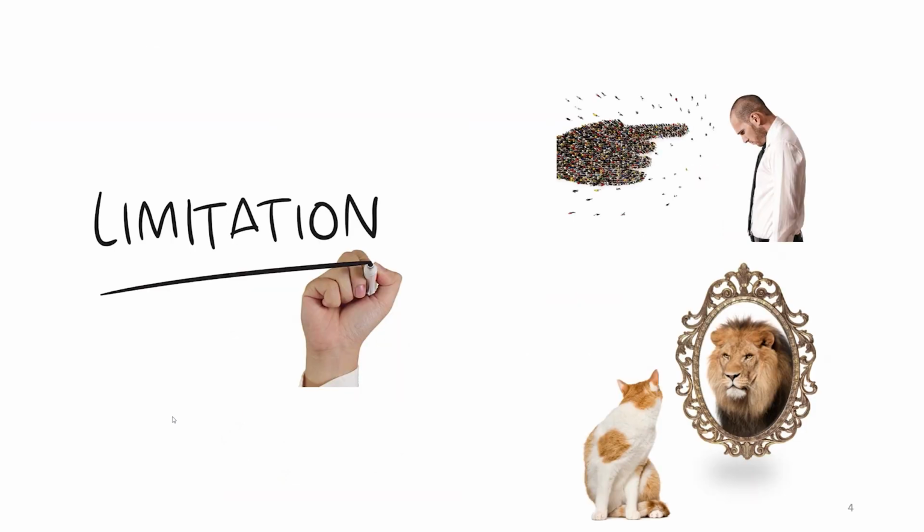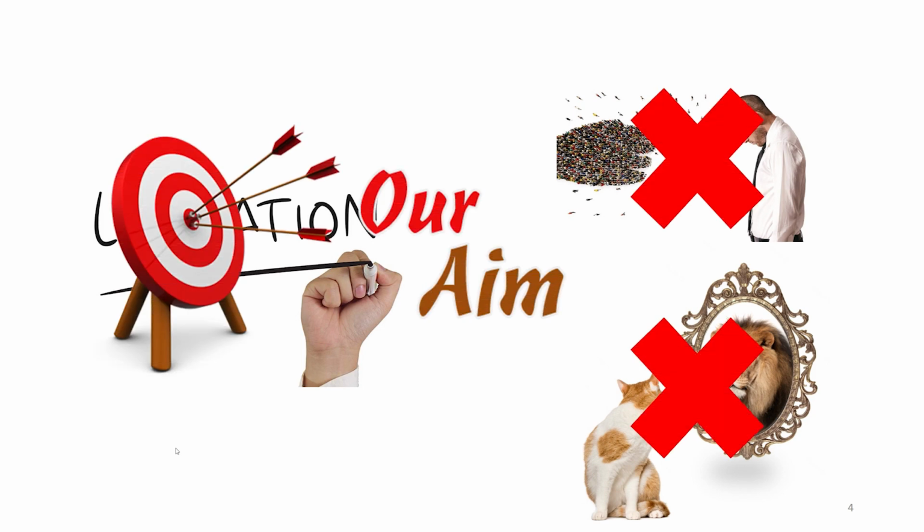First of all, it is prone to human error, because although the detection is done by machine, the calculation is still done by humans. The second reason is overestimation, because several parameters have been shown to be overestimated by this method. So the aim of our study is to eliminate the human error in the analyzing part and also reduce the overestimation caused by the detector.